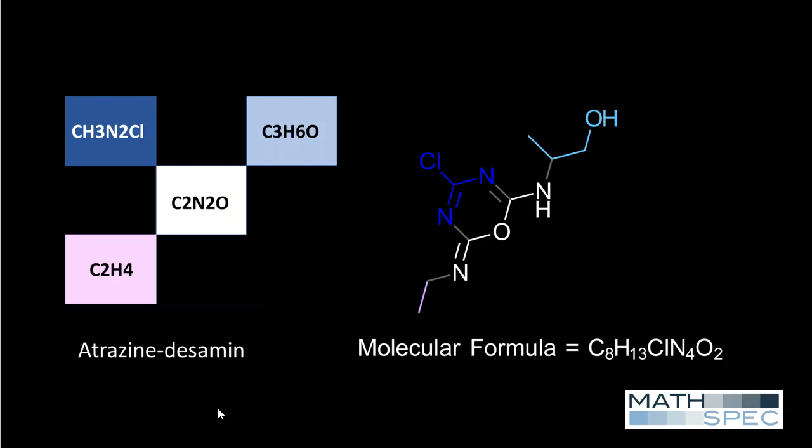So the mass spectrometry reveals only blocks of atoms. The detailed molecular structures that we see are induced from mass spectral data, but those are all in the mind's eye. We must always assume that the simplest explanation is the most likely explanation of the data.